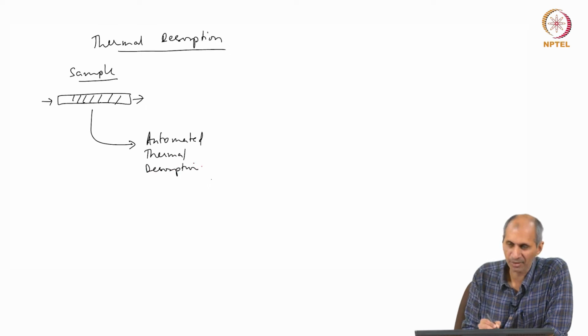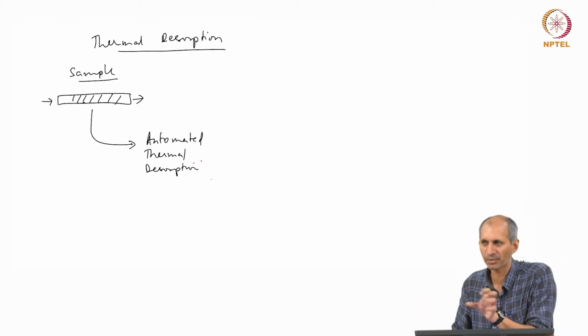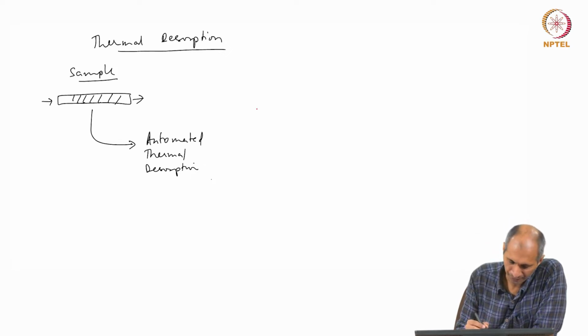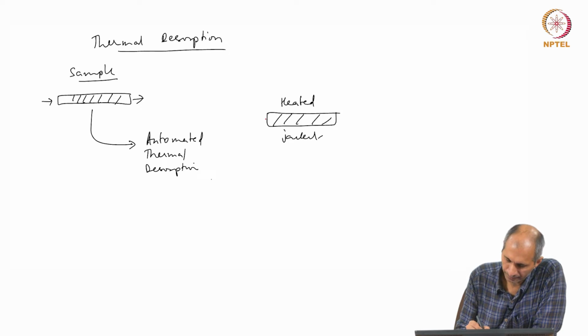It is an accessory to a GC, it is kept before a GC. It does not have to be a GC, it can be any analytical instrument. It is a processing accessory before an analytical instrument. And so, this thermal desorption tube is placed in a heated chamber or jacket or whatever. And it needs to go to an analytical instrument.